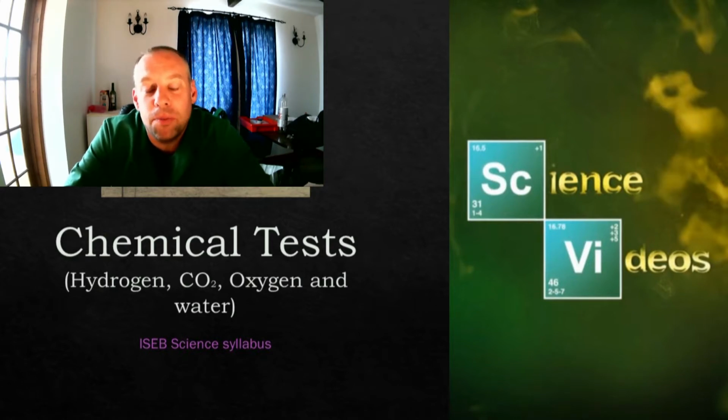Today we are looking at how to perform the chemical tests that we need to do in order to find out what a product is at the end of a reaction. Most of the time we've been doing reactions. In the last couple of videos we were looking at hydrochloric acid with calcium carbonate, for example, where we produced a gas. Now we need to be able to find out what gas that is and identify the different gases and sometimes liquids in different reactions.